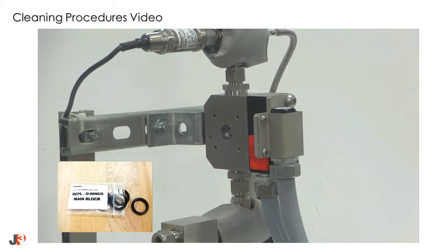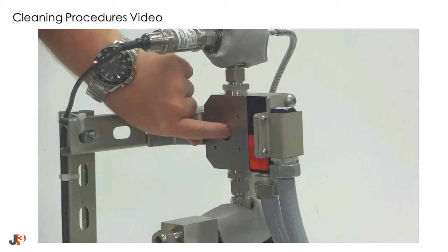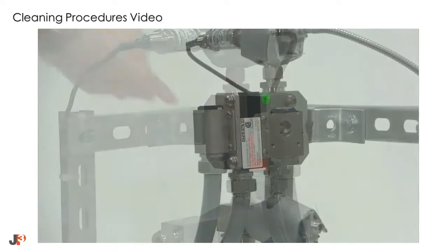Prior to reinstalling the flange, replace both of the main block O-rings. These O-rings are a critical seal and should be replaced anytime the flow cell is disassembled.